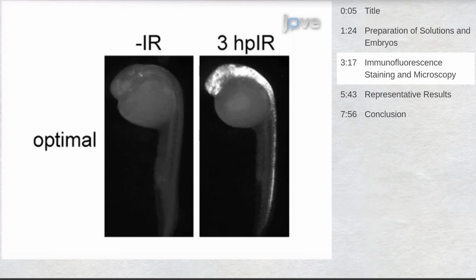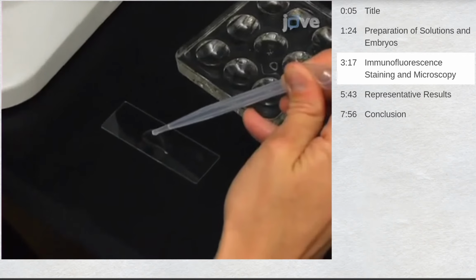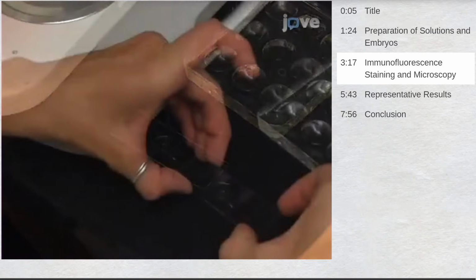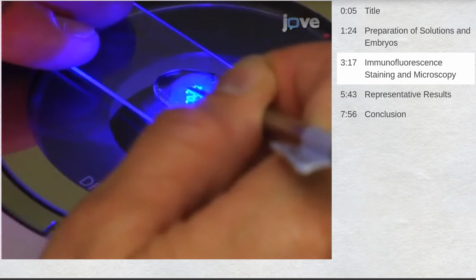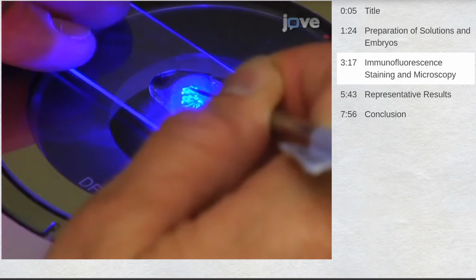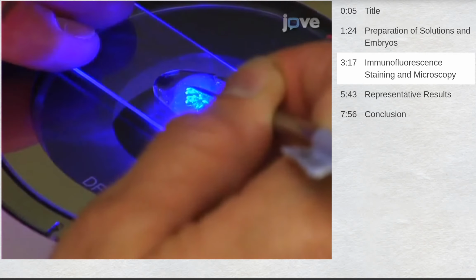If positive controls have bright fluorescence with minimal background, then transfer them to a 3.5 cm petri dish with a thin layer of 4% methyl cellulose, or a depression slide with a large drop of methyl cellulose. Using an angled probe, orient an embryo of interest for imaging, taking images that represent fluorescence intensity and patterns observed in the majority of the embryos from that sample.